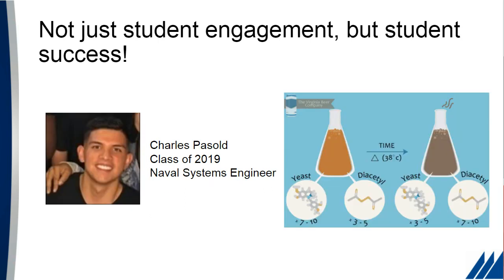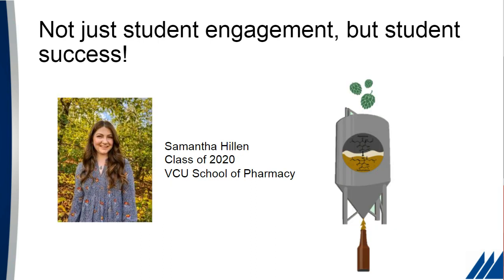So Chuck is the final member of that 2019 class to work on the beer project. He's currently a naval systems engineer for the Department of the Navy. Chuck's work was focused on diacetyl content and, as it turns out, color content as a function of aging. And so Chuck actually developed a synthetic aging mechanism, which we are putting to use even now. Sam actually started the hop project and the alpha and beta acid profiling. Unfortunately, her POGIA experience was cut short due to the pandemic, but she did have a lot of beer work. And again, we finished up the best beer festival of 2020, running those color measurements. And so Sam is starting at VCU's School of Pharmacy in the fall.